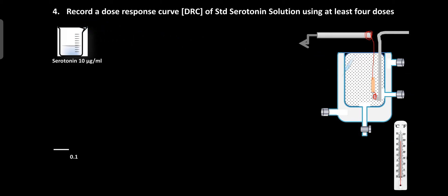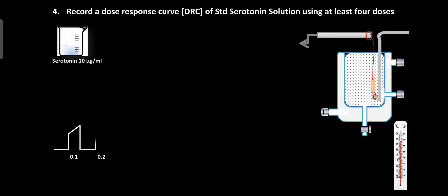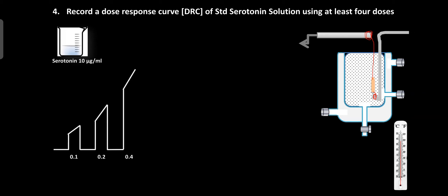Then add 0.1 ml of standard serotonin solution and record the responses for 30 seconds. After 30 seconds, stop the drum and change the Ringer's solution. After the washing period, record the baseline for 30 seconds, then add 0.2 ml of standard serotonin solution and record responses for 30 seconds. After washing, record baseline again, then add 0.4 ml of serotonin solution and record the responses for 30 seconds. After 30 seconds, change the Ringer's solution.